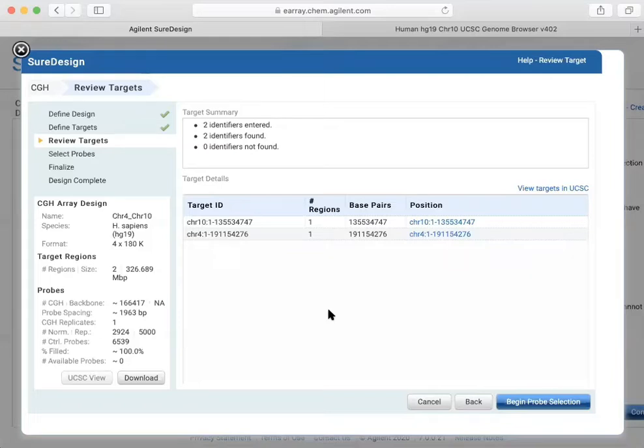For the breakpoint junction, is there any cutoff length? You say 2,000 will be okay. Is there any cutoff for that to find the breakpoint?